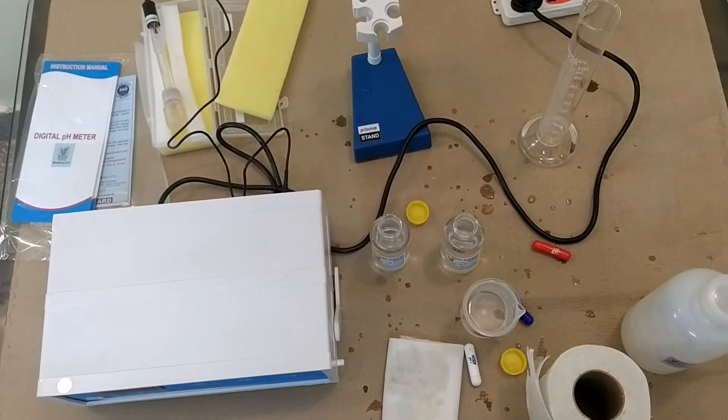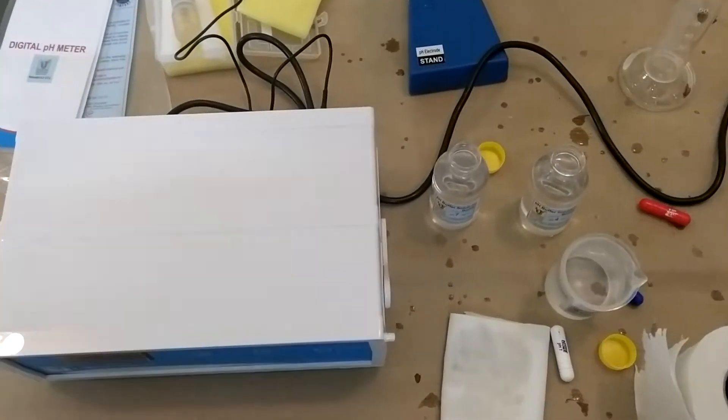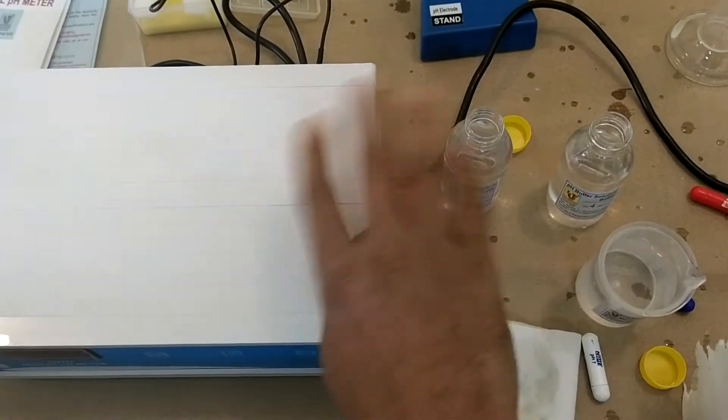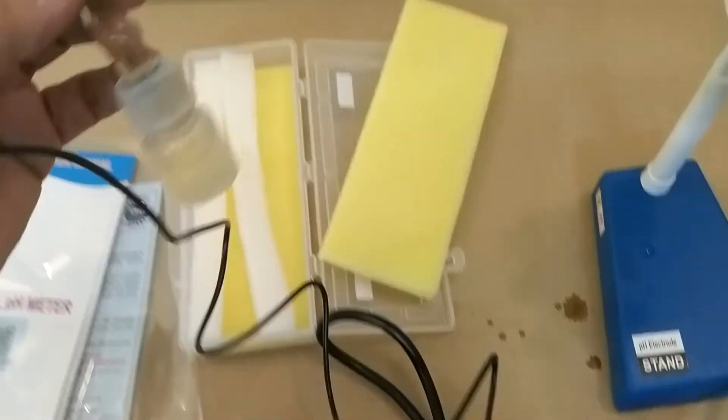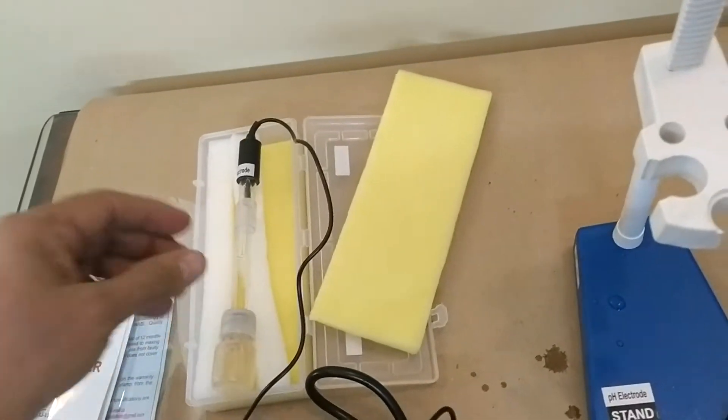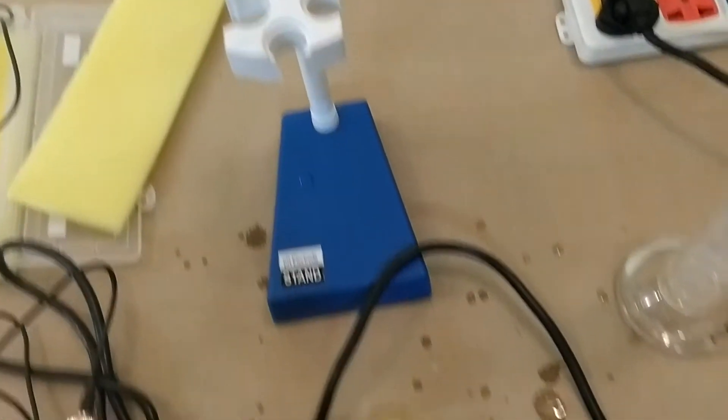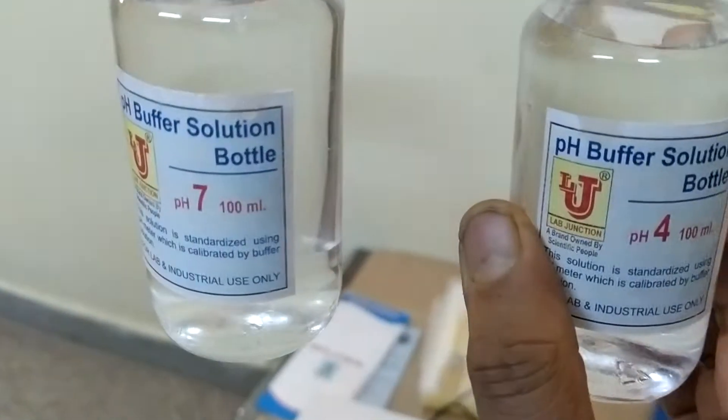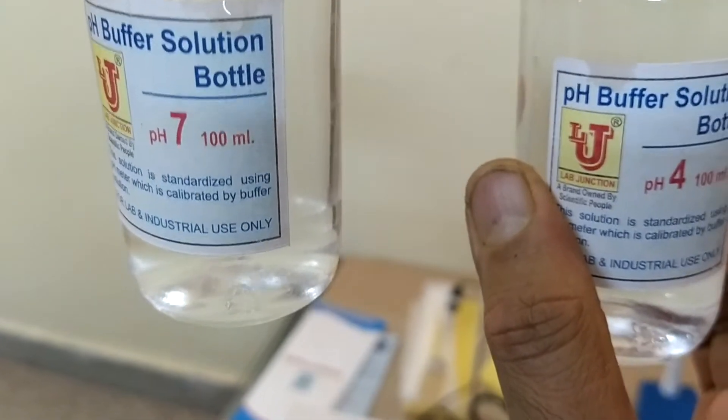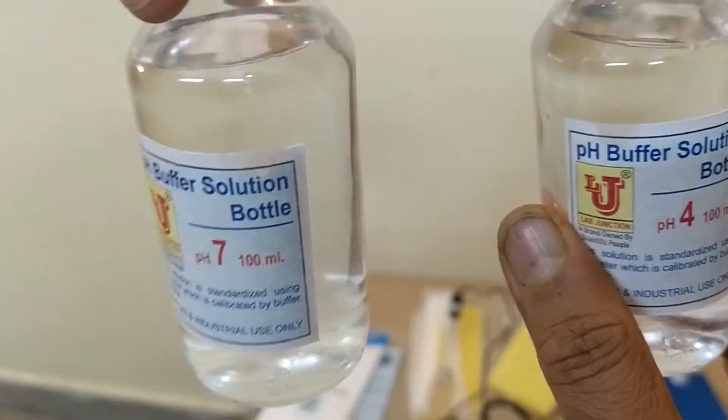Auto-Digital pH meter. With this pH meter, you have Unit 1, Auto-Digital pH meter. Second one, pH combination electrode. Third one is pH stand. Fourth one is 2 standard buffer bottles with 7 pH and 4 pH capsules.